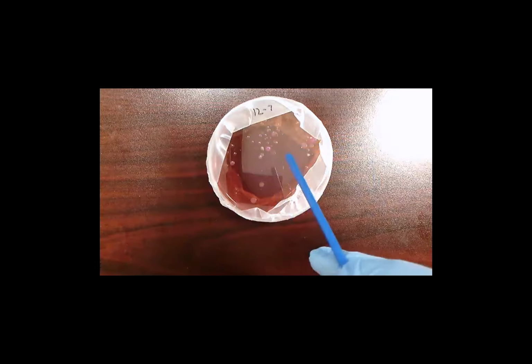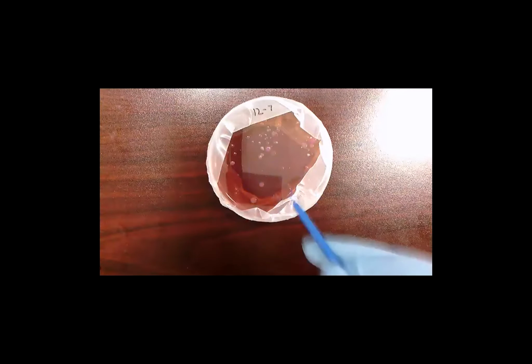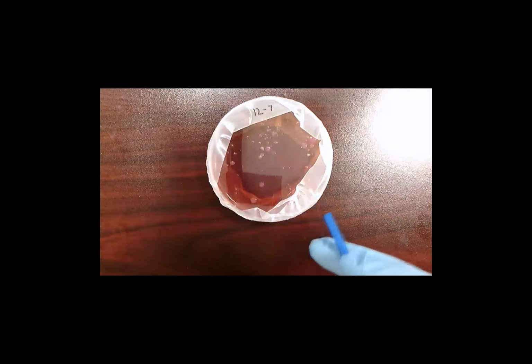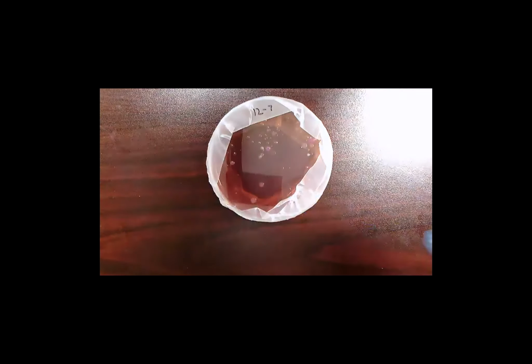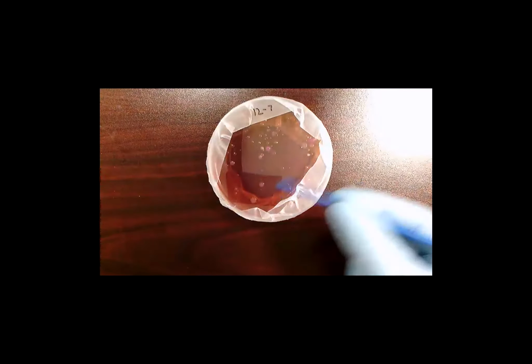So for this agar, they are going to count the coliform or E. coli colonies, the pink and purple ones. Sometimes they get pretty dark too on the agar. These right today at 48 hours are a little lighter. If you were here, they're kind of pretty. But if they're out a few more hours, they may turn darker, is what I've noticed. So they would just count those.